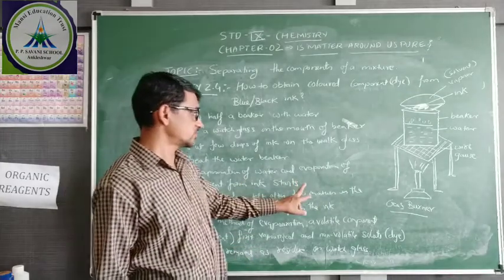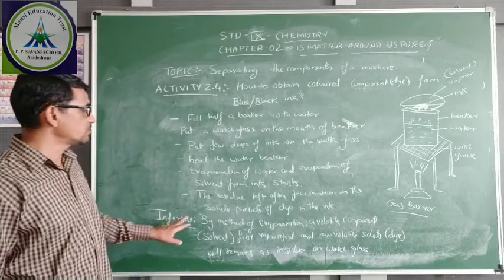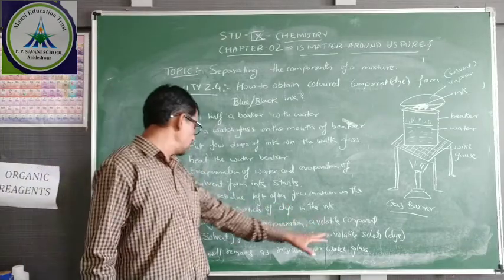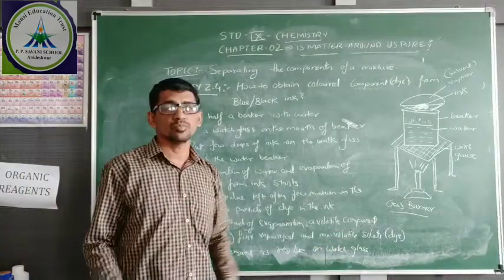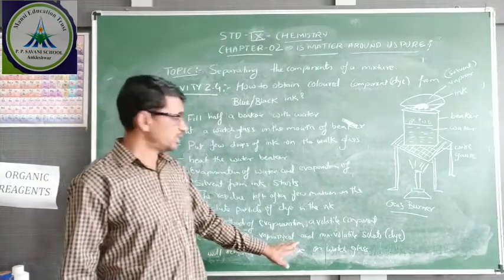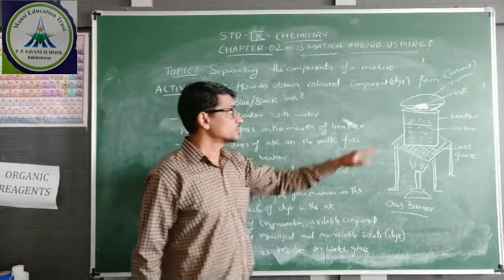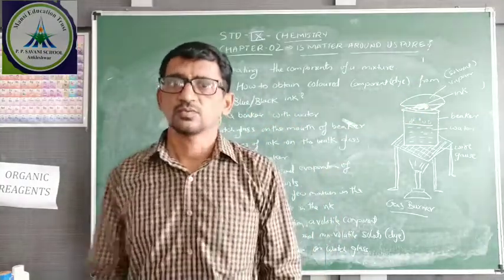The volatile solvent vaporizes first, and the non-volatile compound, that is the organic dye, will remain as a residue on the watch glass.